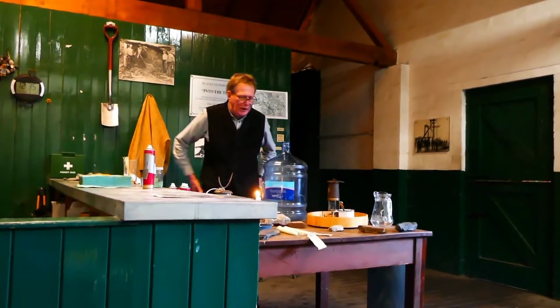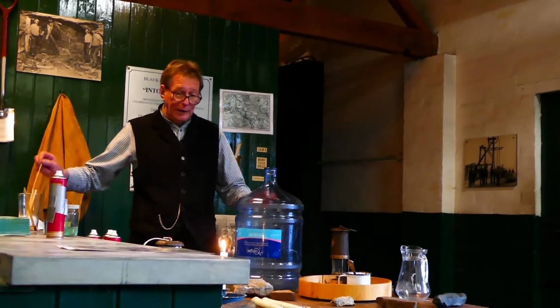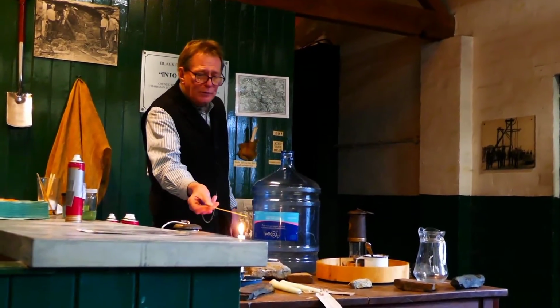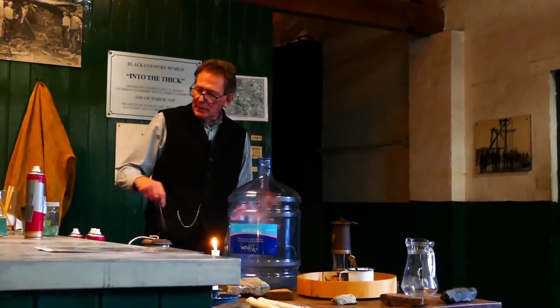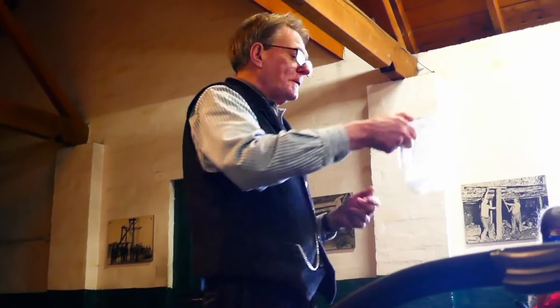So what I'm going to do now is introduce a naked flame to the methane, just to show you exactly what happens. Oh God. Carbon dioxide that's been produced from the reaction.